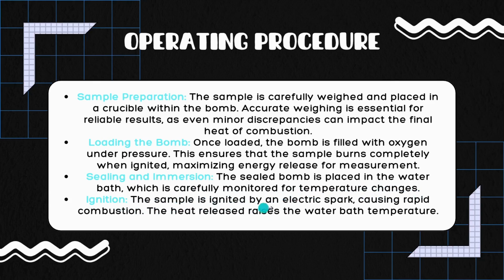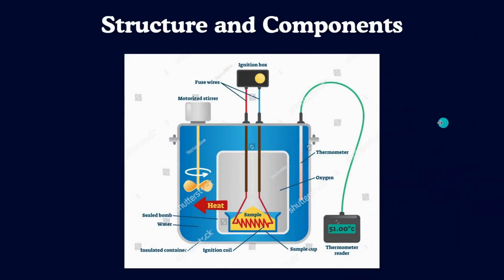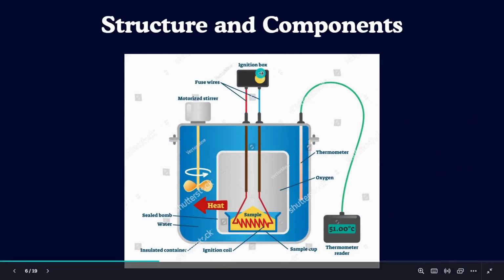Ignition. The sample is ignited by an electric spark, causing rapid combustion. The heat released raises the water bath temperature. Here is the sample which is ignited.